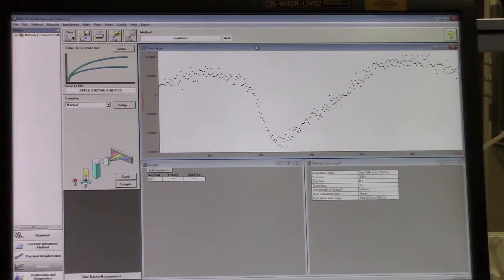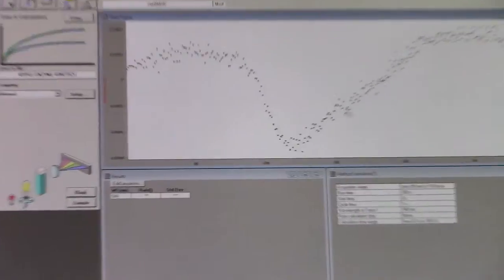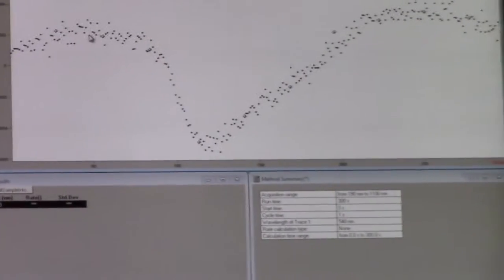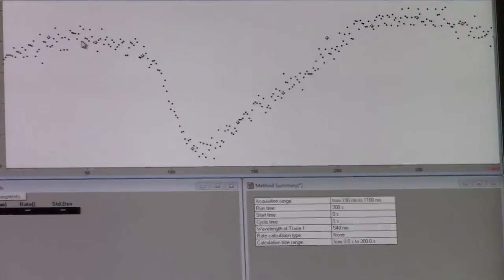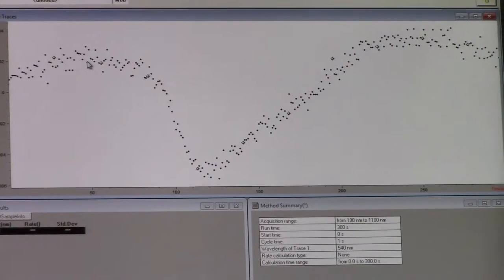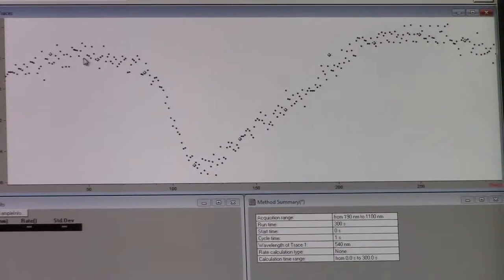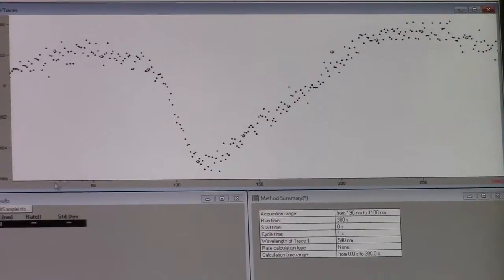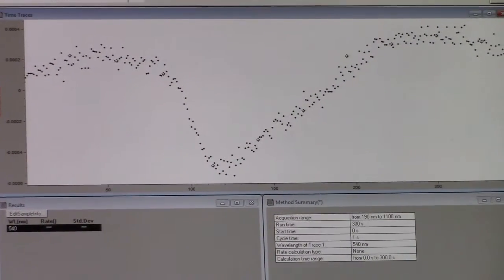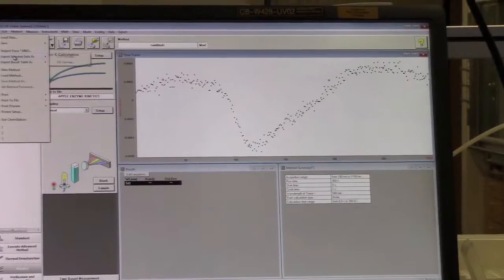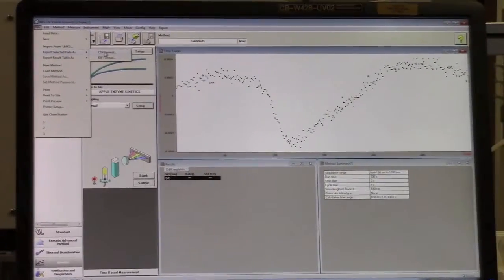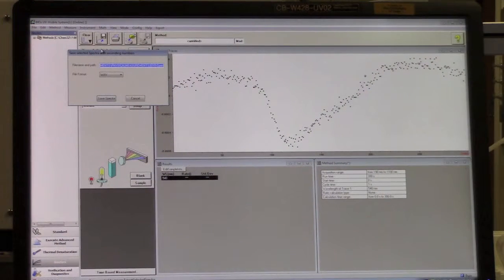Once the measurement is complete, you'll see a detailed view of the time trace, the absorbance versus time in seconds. You can export this data as a CSV file by clicking on the data, going to File, Export Selected Data As, and selecting CSV format.